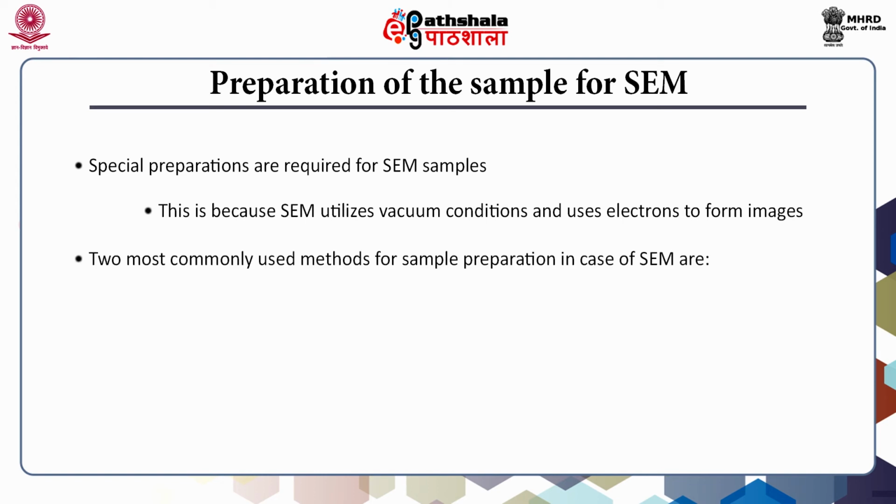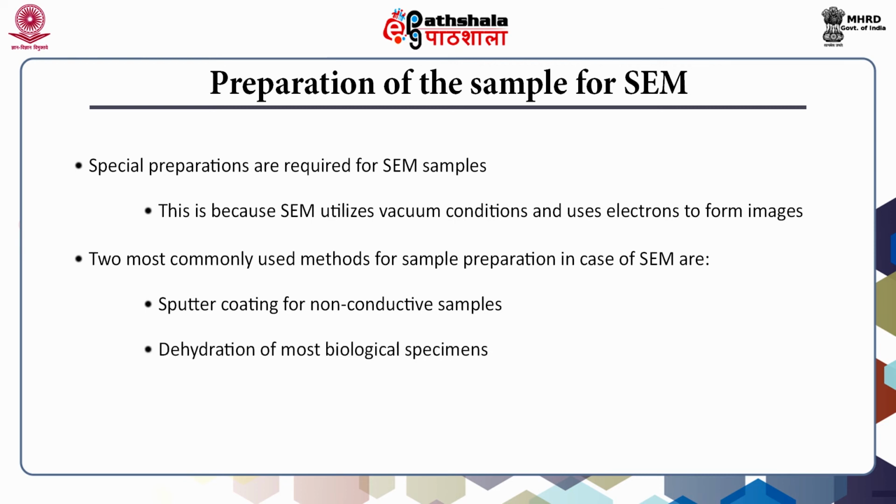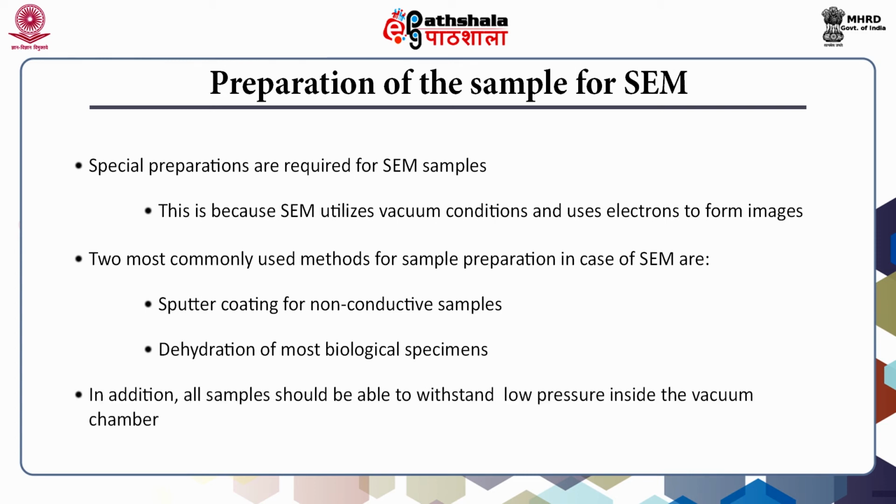Two most commonly used methods for sample preparation in case of scanning electron microscopy are sputter coating for non-conductive samples and dehydration of most biological specimens.